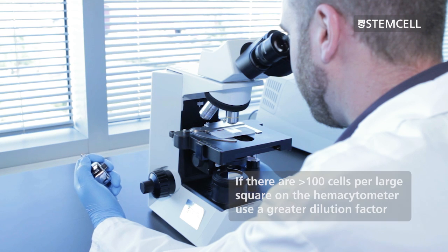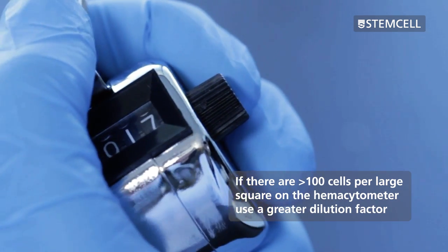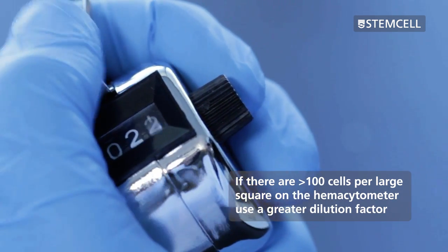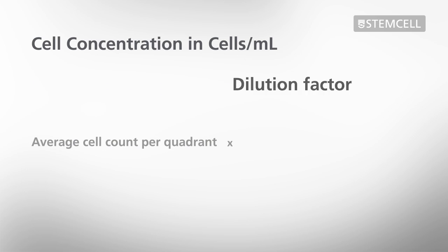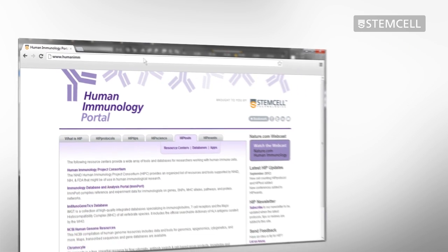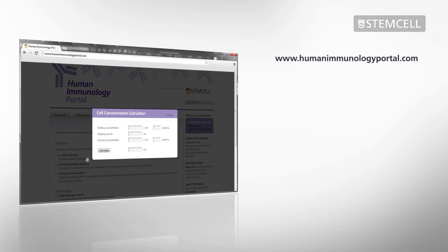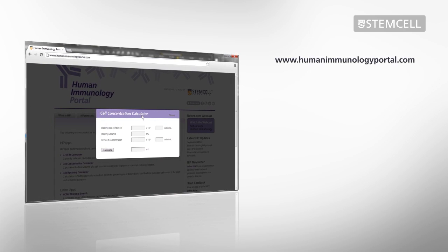If there are more than approximately 100 cells per large square on the hemocytometer, prepare a new diluted sample with a greater dilution factor. To calculate the cell concentration in cells per milliliter from your cell counts, multiply the average cell count per quadrant by the dilution factor and 10 to the 4. You could also use an online tool like the one found on the Human Immunology Portal to convert cell counts into cell concentration.